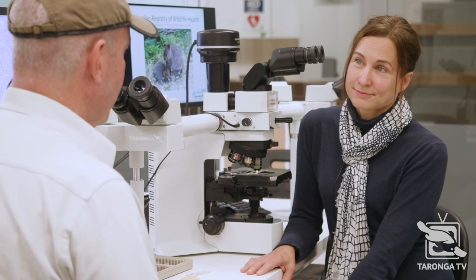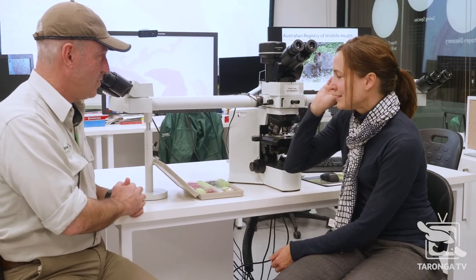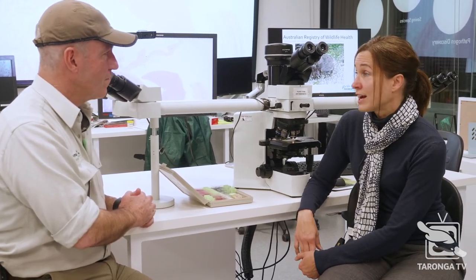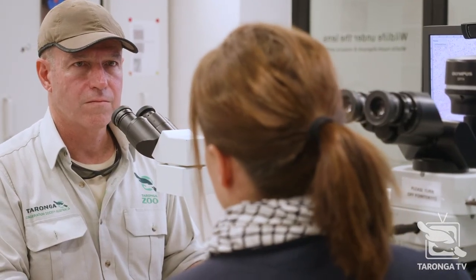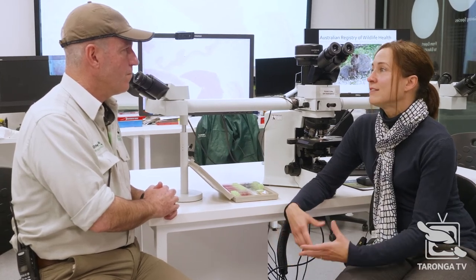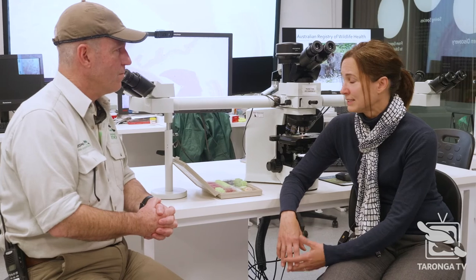So can you give us a little bit of a rundown of what we're sitting with here? Because there's some extraordinary equipment in here that's definitely not in the wooden box or the polystyrene. This is top drawer. That's right. At Taronga Institute of Science and Learning, we're very fortunate to be incredibly well equipped, and a lot of that has come through donations and grants from granting agencies for some of the research that we do. What we have here is a multi-header microscope for teaching purposes, so that we can take all of this massive resource from looking at wildlife health for the last 35 years and make it available. We make sure we've got students coming through, that we run educational programs, and that we power research predominantly at the graduate level.